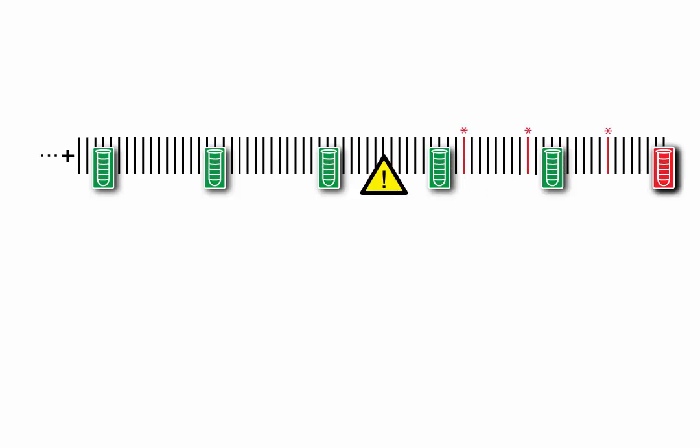In this example, the first two QC events subsequent to the out-of-control condition failed to detect it, but the third QC event gave a QC rule rejection, denoted by the red test tube. During the time that the test system was out of control, 3 patient results had measurement errors that exceeded the quality requirement, denoted by the red asterisks. 2 of the unreliable results occurred prior to the last accepted QC, and 1 unreliable result occurred since the last accepted QC.